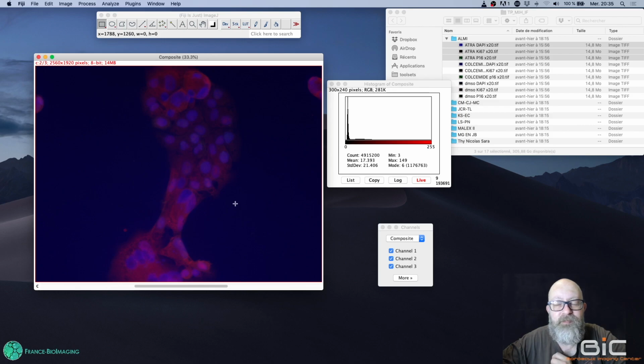So this will be useful for one of the next steps when we will try to differentiate the signal pixels from the background pixels. And there is surely a way to set a limit in between the two and consider only those pixels, the ones with a higher intensity.